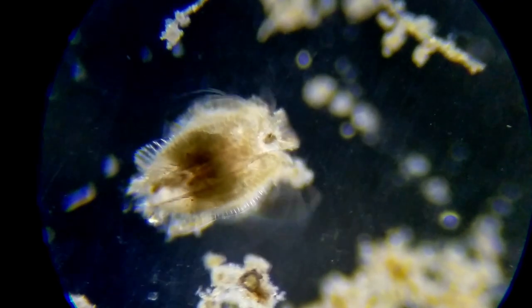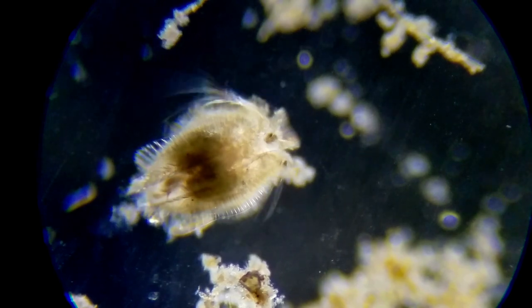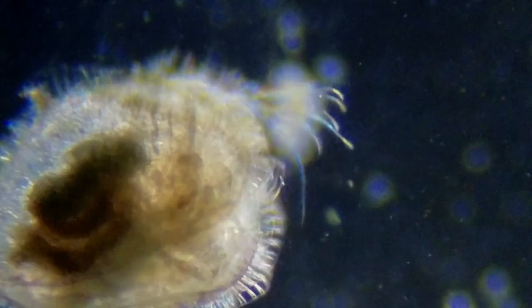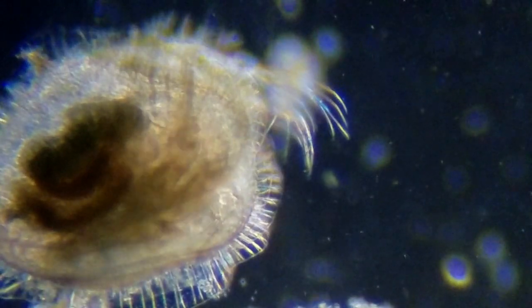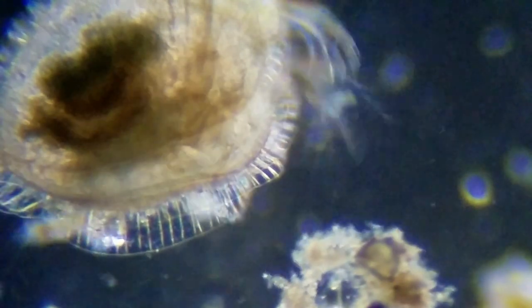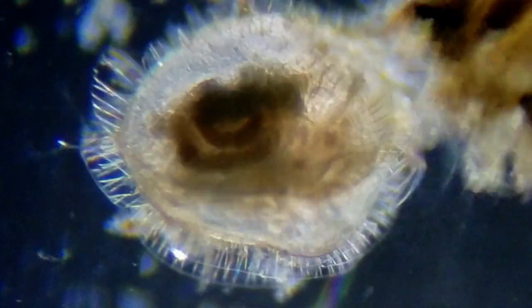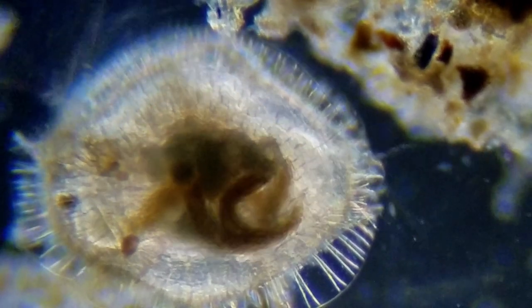Here's one of these guys — you see his legs. There's a lot of little hairs right there. And inside him it looks like little claws here. Generally crustaceans have this. He reaches out — there you go. That's normally the way you see these guys, they're just rambunctious. Spinning like that, they can really tear up a lot of algae. And look at that arm right there — see that? Arm grabbing. That's interesting.